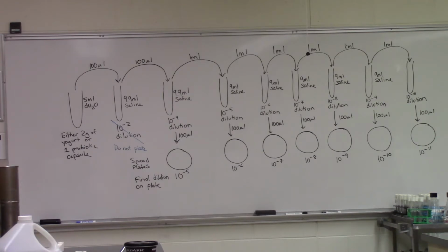You would either write it out in your lab notebook, or if you're lucky enough, as you will when you do this in person in the labs, you'll have a schematic that we've prepared for you. Or in this case, we have a convenient whiteboard, so we spent some time writing it out so we know exactly what we're doing for all the steps here. I'm not going to go through it because we've gone through similar dilution series in class already. I'm just going to let Sabrina come on in, and we're going to start showing you how you do this.